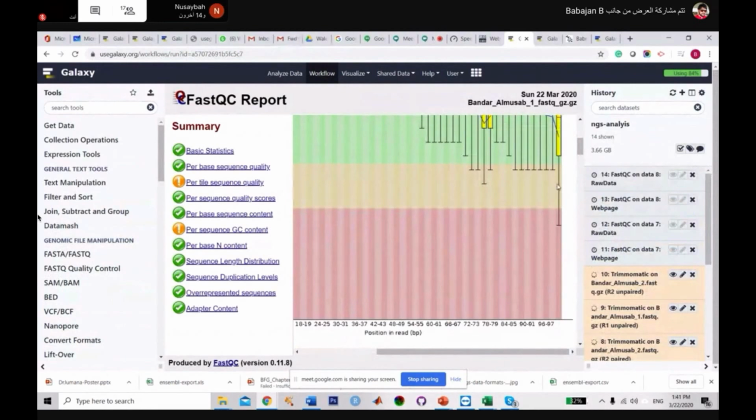Okay, so any doubts regarding FastQC? So shall we continue to the next step?